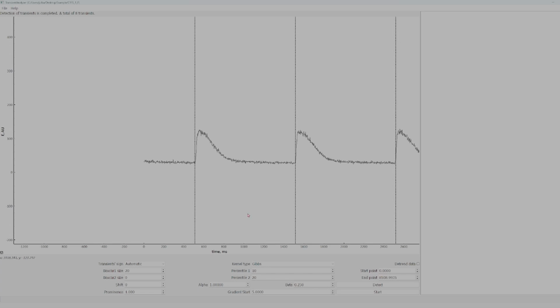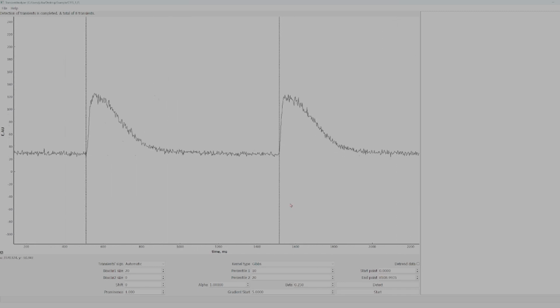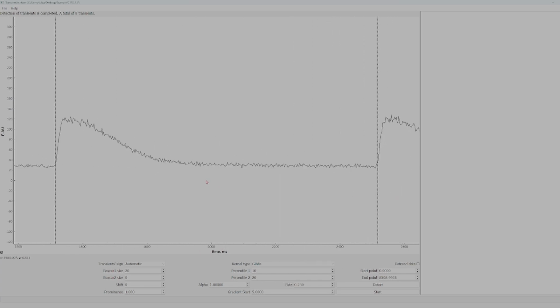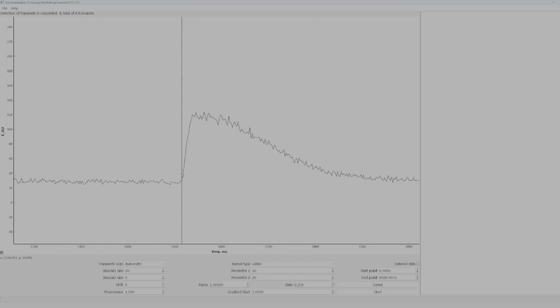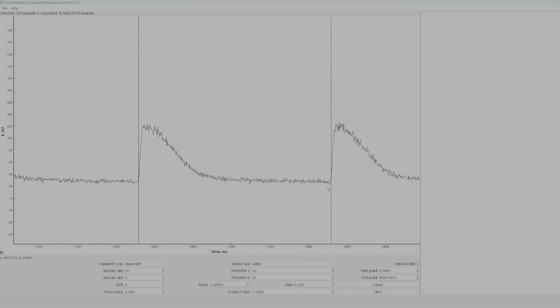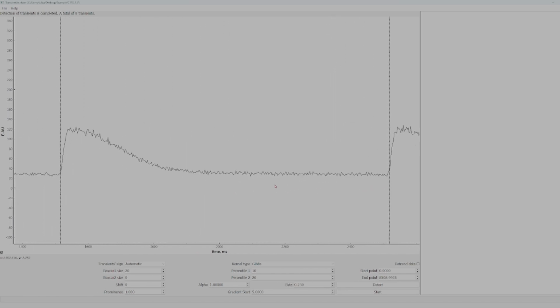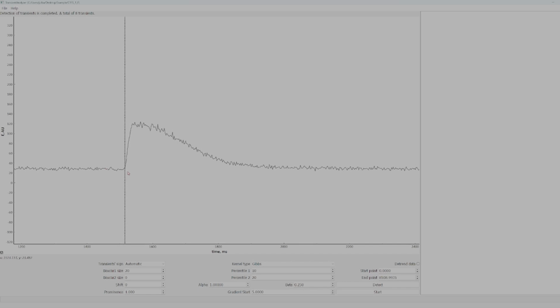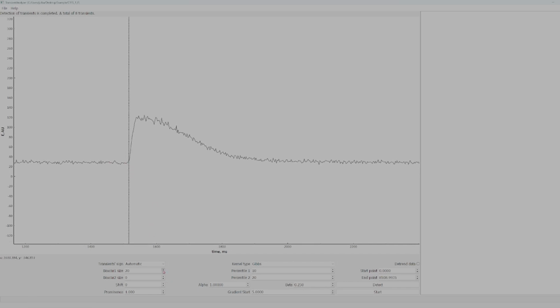You definitely need to look. In this case, it looks like everything is fine, the detection was perfect, and I can go and analyze, but no, just go deep. And you will see that no, it is so bad, and you need to move this starting point somewhere here, and you can use for this boxcar size 1.